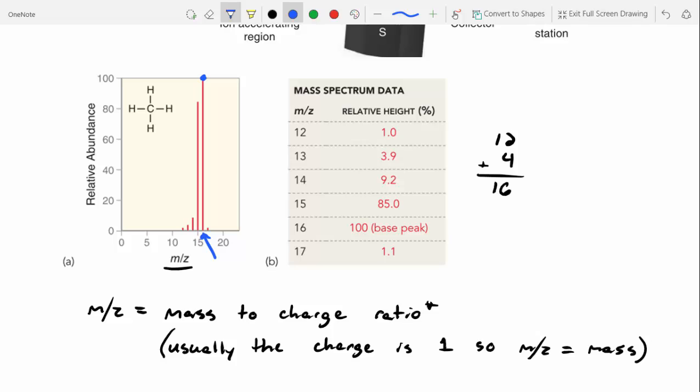What do you guys think? It could be some hydrogens that got dislodged. Like I mentioned, mass specs obliterate your molecules. So these lighter portions down here could be fragments, meaning they're the pieces that got obliterated in the mass spec.